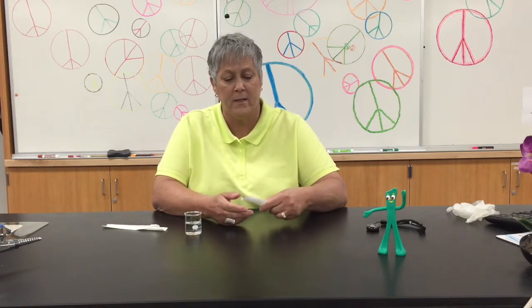Hi students, welcome to One Minute Microbiology Techniques with Lisa Schimmel. Today I'm going to show you how to use a sterile pipette.